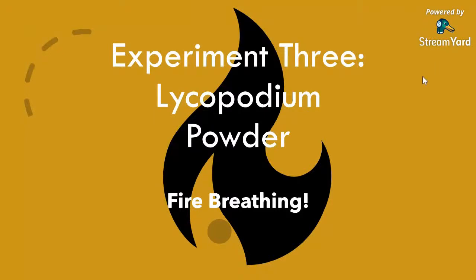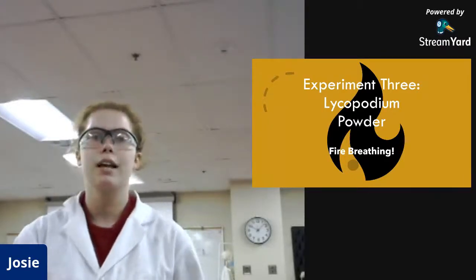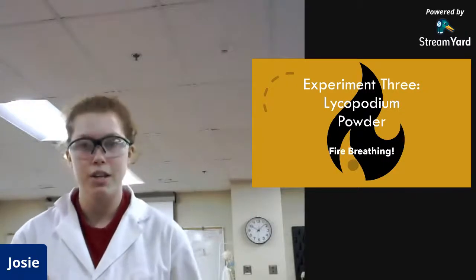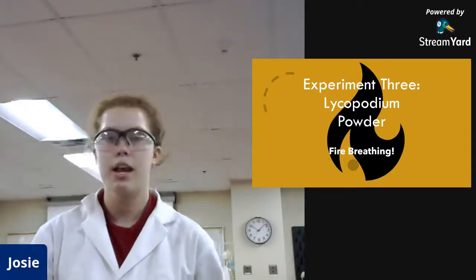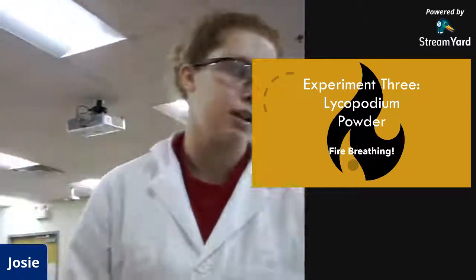So the third thing that I'm going to do for you today is we're going to be catching something called lycopodium powder on fire. Some people like to consider this the fire breathing experiment, because it looks like you're breathing fire when you do it. So my friend Callie is going to pivot the camera so that we can go to where the setup is, because it needs to be out of the way of anything that is flammable.